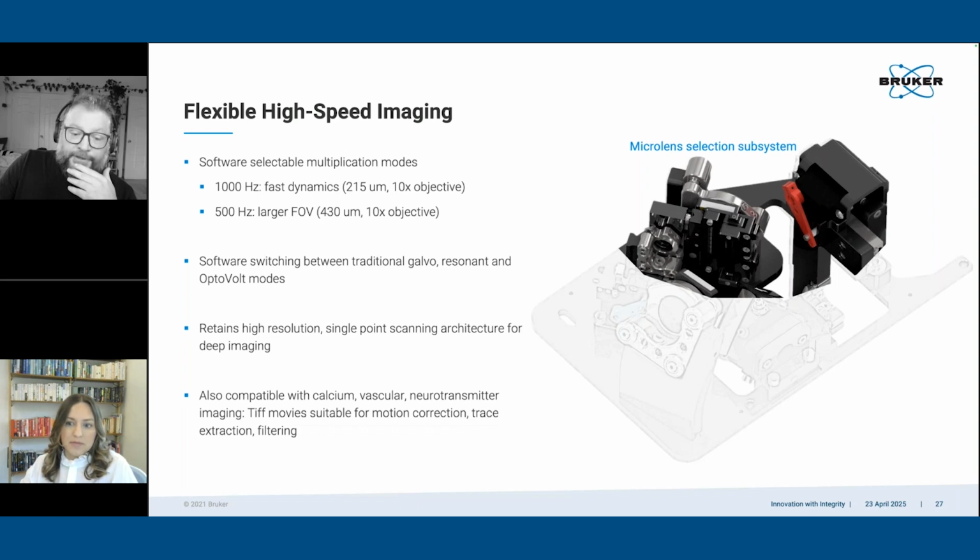Yeah, it could, right? So you essentially define its zero point manually by telling it what it thinks zero is, truly by comparing it to the image you generate in just the unlocked path. So no objects in the line there. And that's like the true working distance.